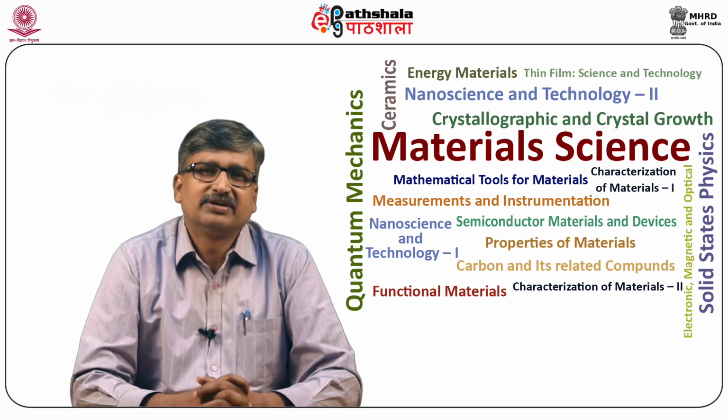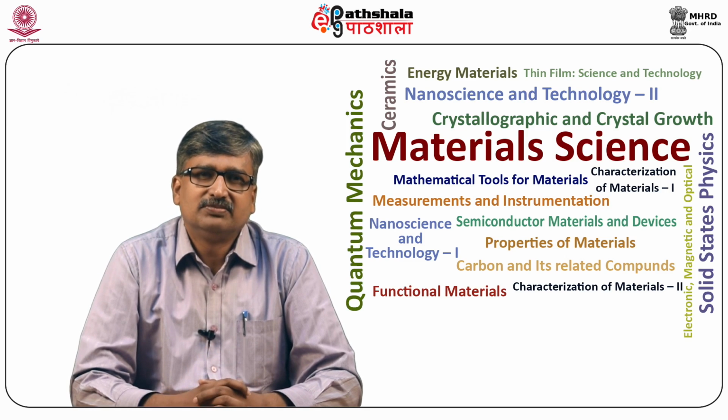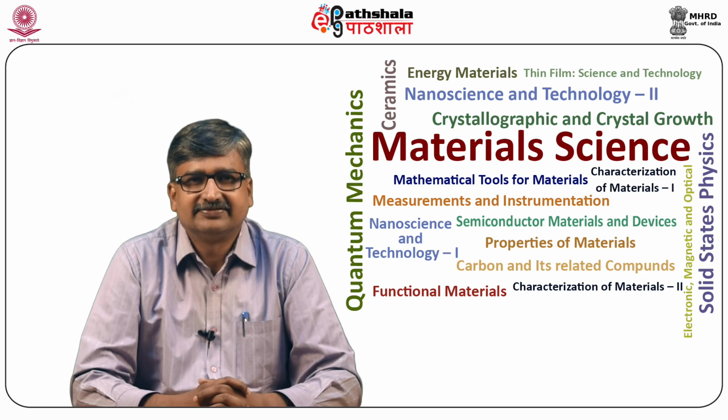Today, we are going to discuss the module titled Capillary Electrophoresis, laser-induced fluorescence detection, known as CE-LIF, under the paper Nanoscience and Technology 2.